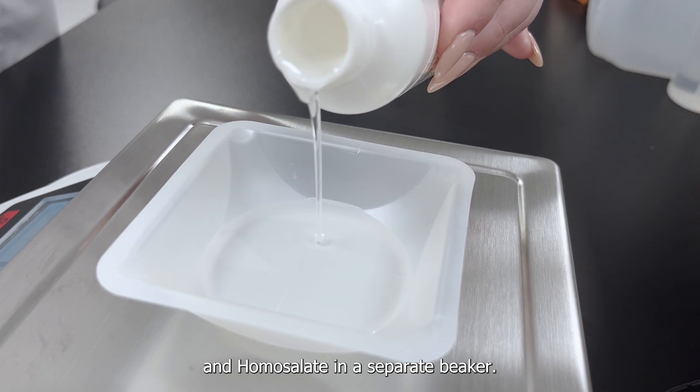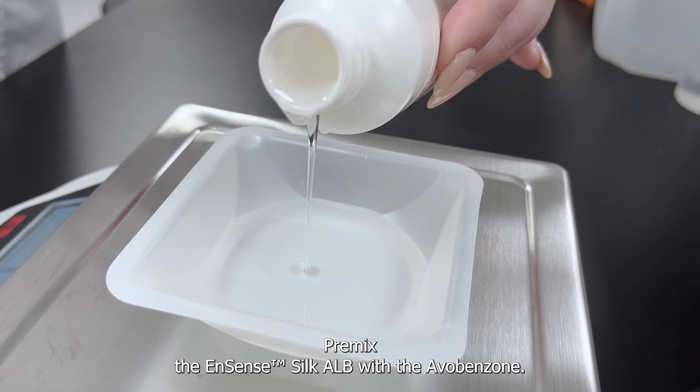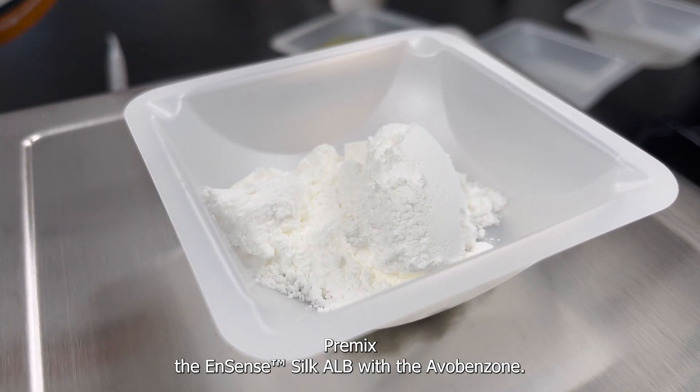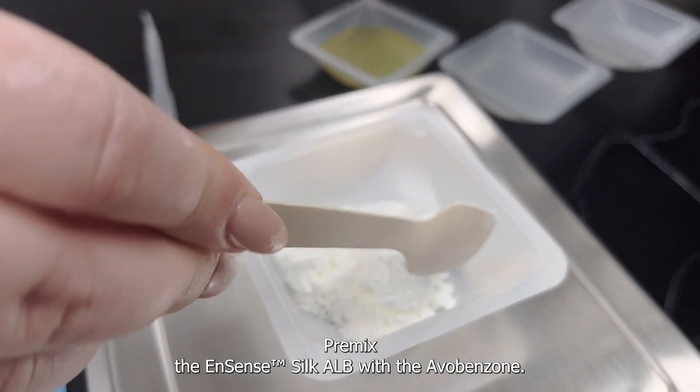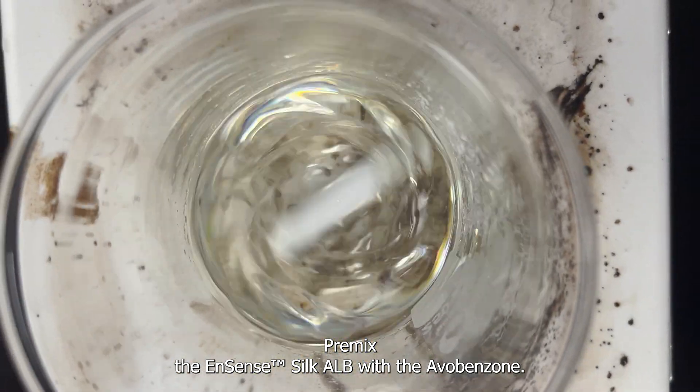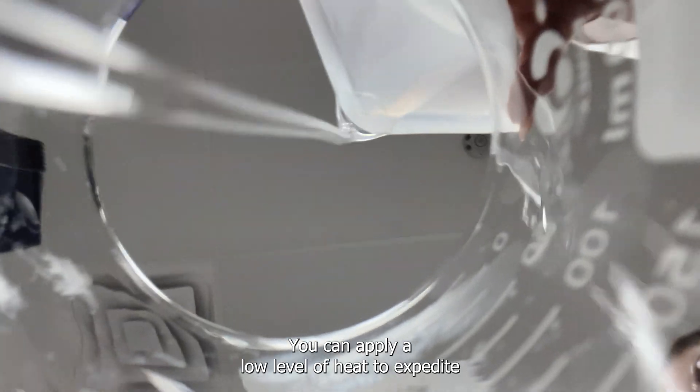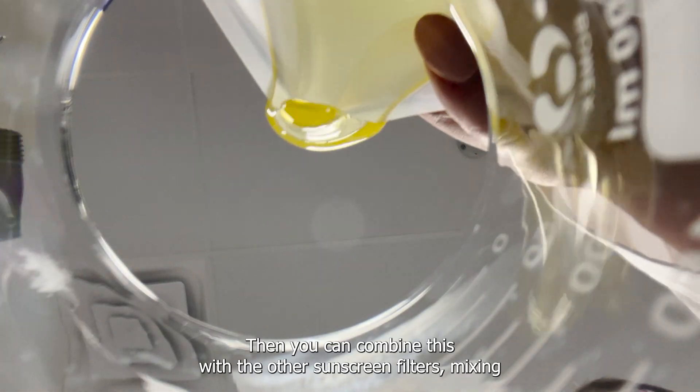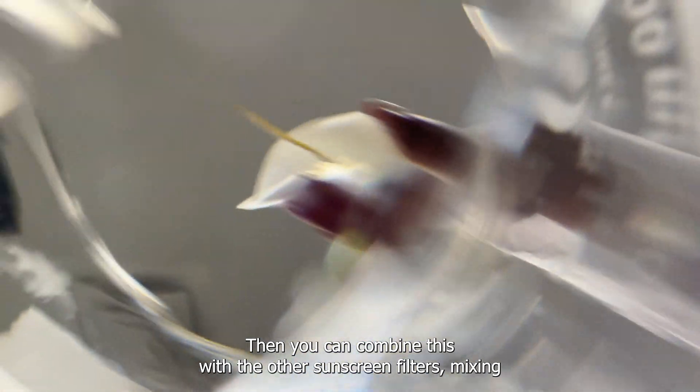In a separate beaker premix the Ensense Silk ALB with the avobenzone. You can apply a low level of heat to expedite. Once the avobenzone is fully dissolved in the alkyl benzoate, then you can combine this with the other sunscreen filters. Mixing until uniform.